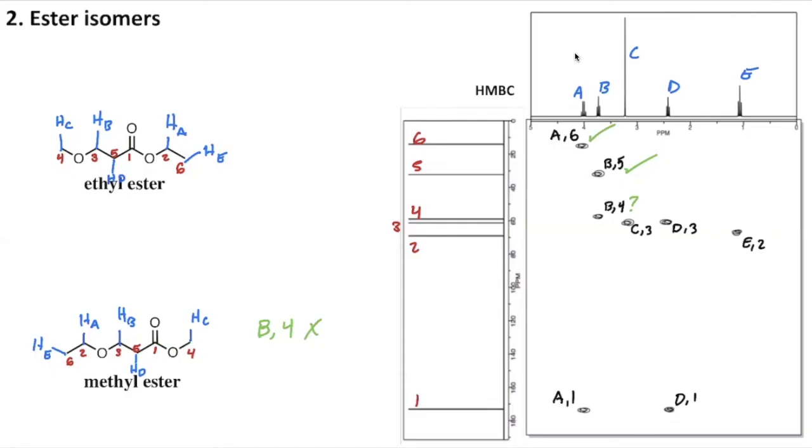Okay, C to 3. Let's see about that. On our top structure, C coming down, over and over again. C3 checks out for the top one. And then on the bottom one, looks like we might be in trouble again. We go from C to 3. It's taking us, again, 1, 2, 3, 4, 5 bonds to do it. That also seems pretty suspect. So let's add that to the list of factors that don't add up for our bottom molecule. Not looking too good.